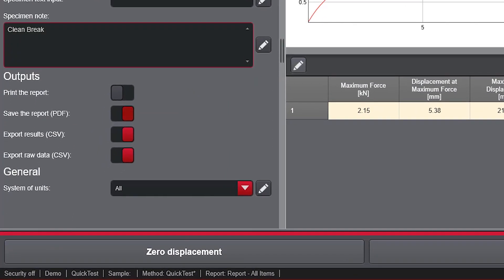With QuickTest, users can also configure outputs, including saving a report and exporting raw data and results.